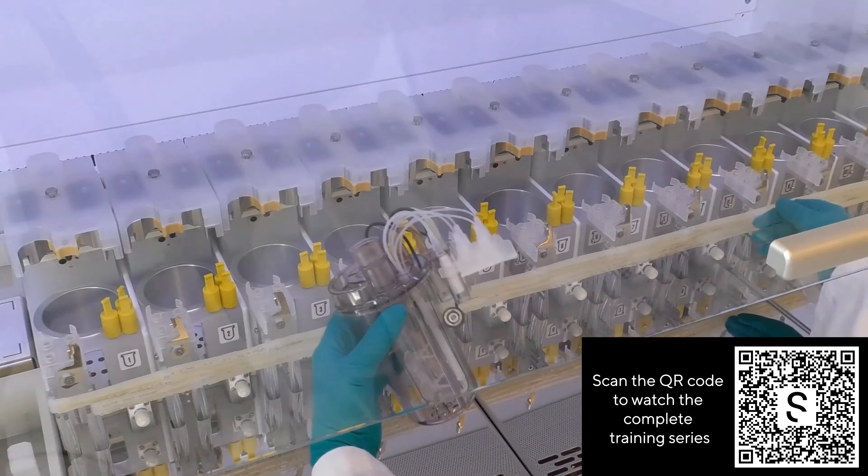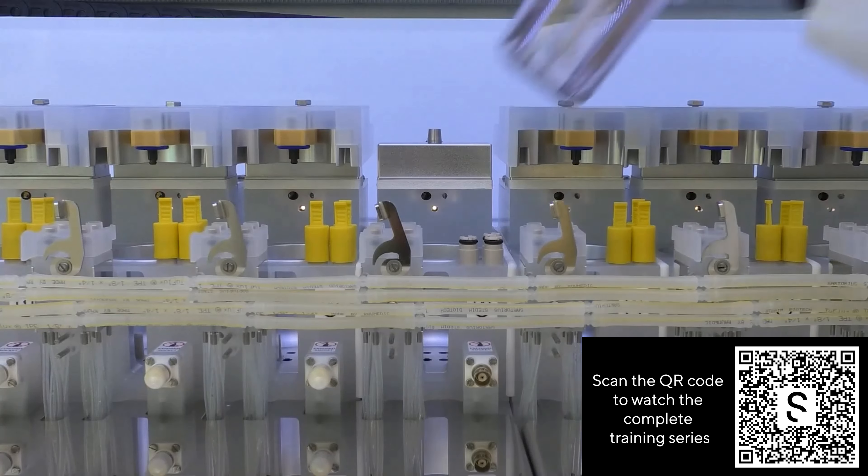This tutorial covers initial system cleaning and preparation, experimental setup, in-process activities, post-experimental routine and regular maintenance.